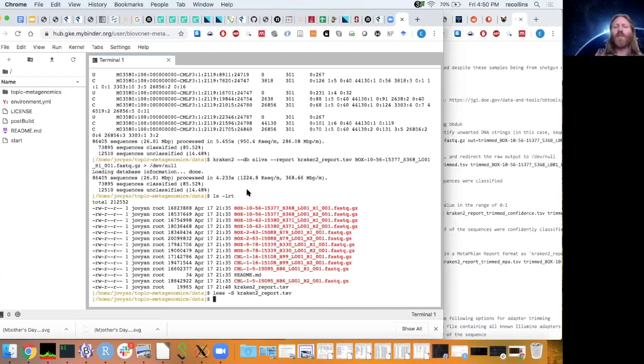And if you have a small shear length, for example, if the sequences that go into the library prep are shorter than the read length of the instrument you're using, then you can have read-through, where on the right-hand side of the read, it can actually read into the primer and the adapter and everything on the opposite side.